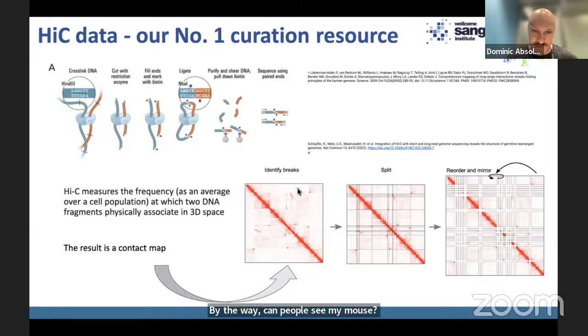We can see on the off diagonal signal, which is indicating that pieces should be moved around and rearranged to fit them onto the diagonal and resolve it.